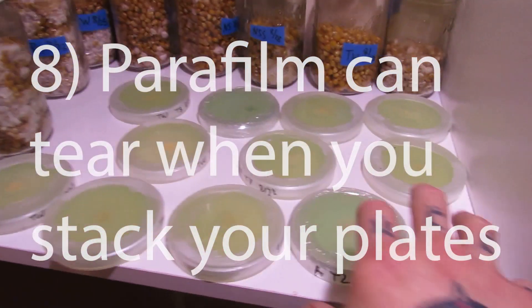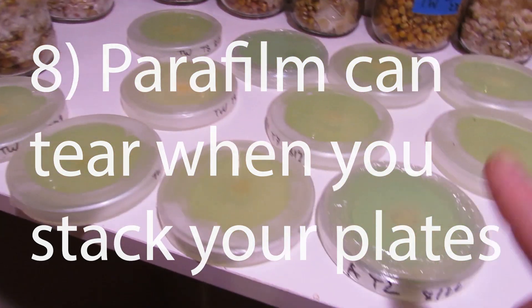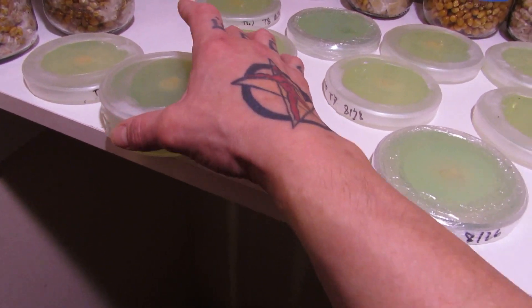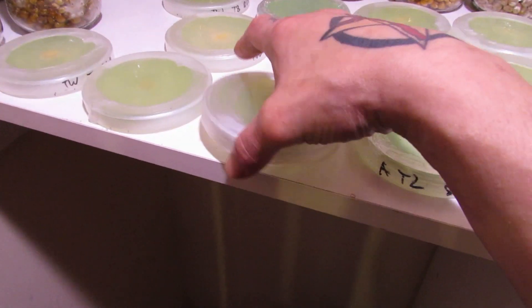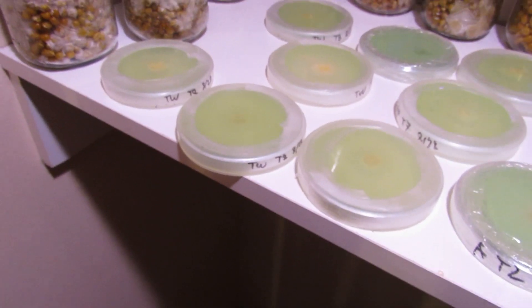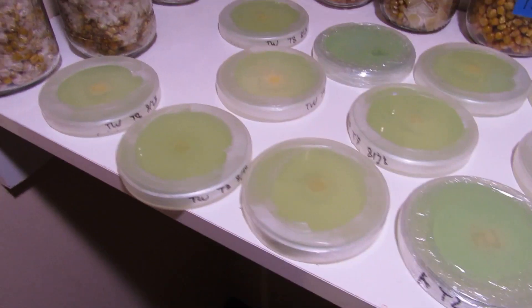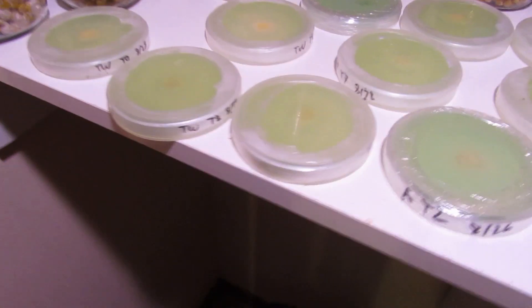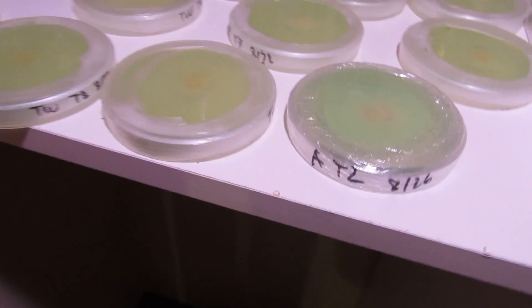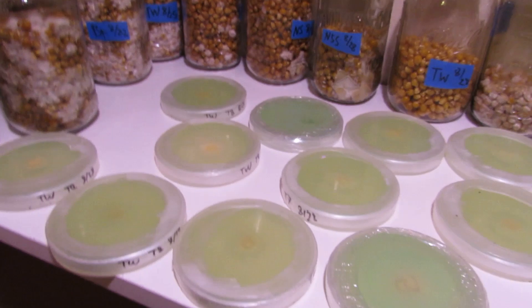Another thing about parafilm: you'll see I have my plates all spread out — I'm not stacking them on top of each other. If you stack plates wrapped with parafilm, they can stick to each other and create tiny micro-tears on the edges where air and bacteria can get in and contaminate your plate. So I keep them spread out to avoid those tears.